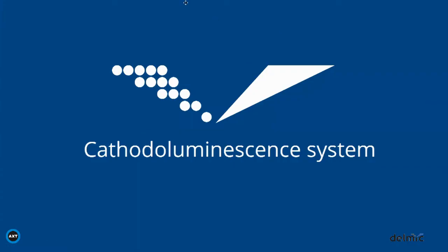So this gives me an opportunity to check if there are any questions. And there's one question, somebody is asking whether it's necessary to have a field emission gun for coherent cathodoluminescence. And this is not the case. The coherent cathodoluminescence can be observed for any type of electron gun. The coherence really comes from the fact that the electric fields of a single electron are coherent with the light that is emitted. And the coherence of the electron beam itself is not so relevant in this case. And so you can also see it for tungsten tips or for LaB6 tips.